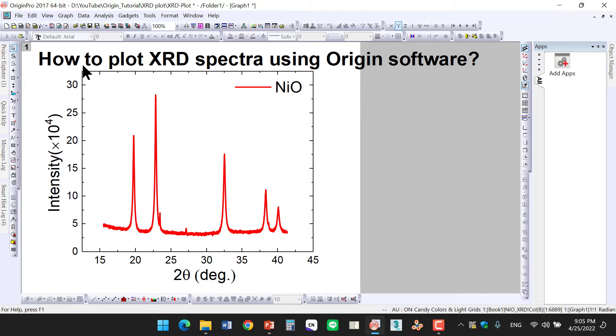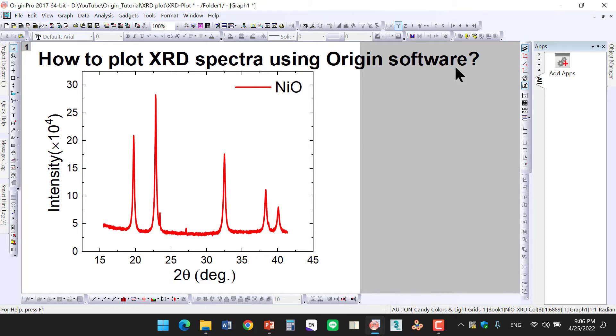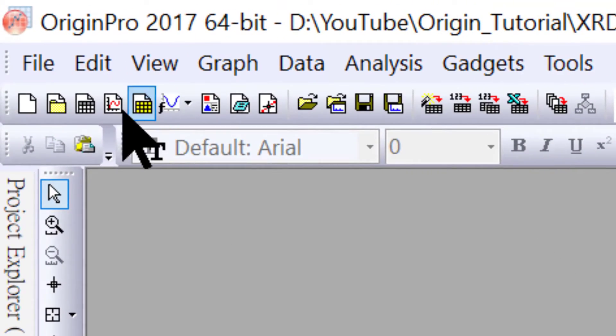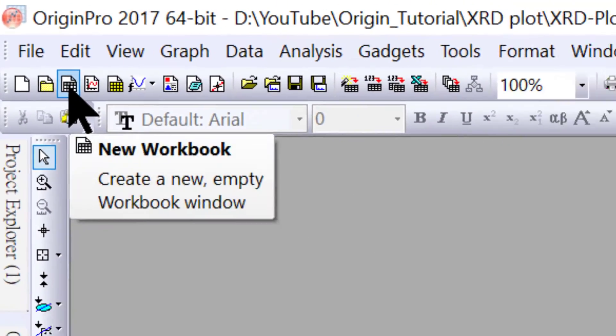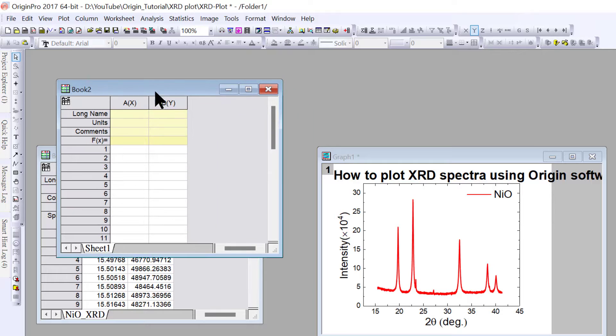In this video, you will see how to plot XRD spectra using Origin software. This is XRD data of nickel oxide where the x-axis is 2 theta and the y-axis is intensity. Let's open a new worksheet.